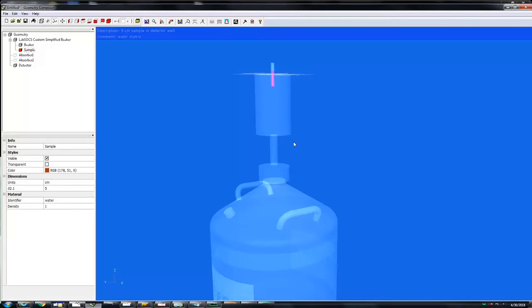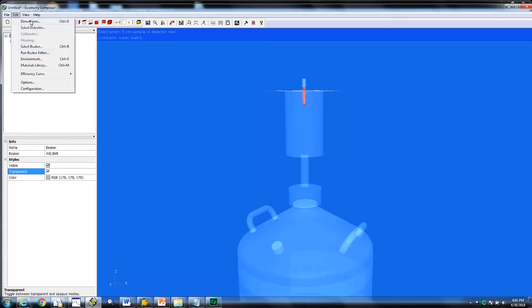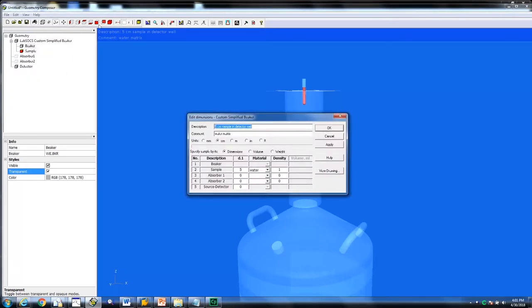Next, we will show you how to adjust the fill height. Changing the fill height can be done in two ways. The first way is to click on edit, then click on dimensions. Change the value to your new value.